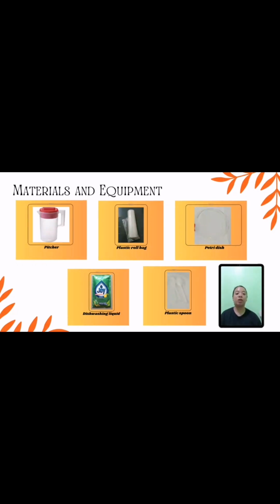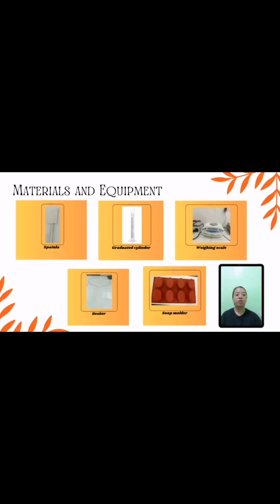And the dishwashing liquid or soap we use for cleaning the materials that need to be washed. We also use a spatula to carefully combine lye with oils and additives with soap, as well as to scrape soap butter off the container into the mold.